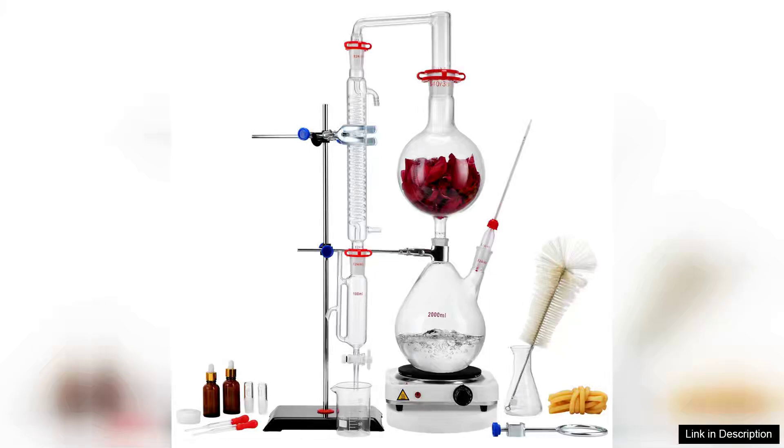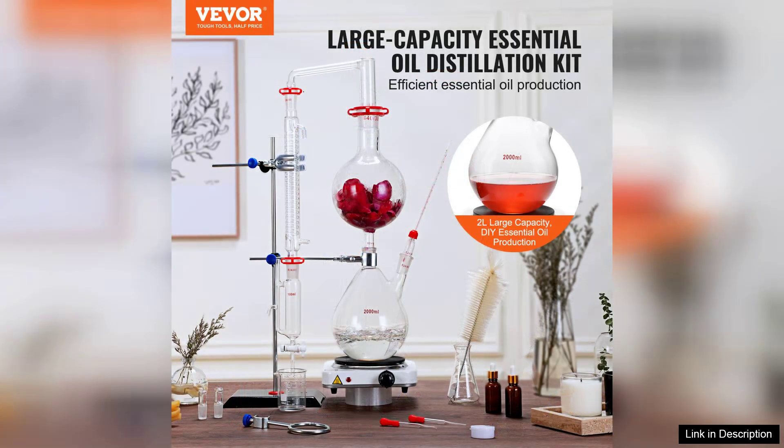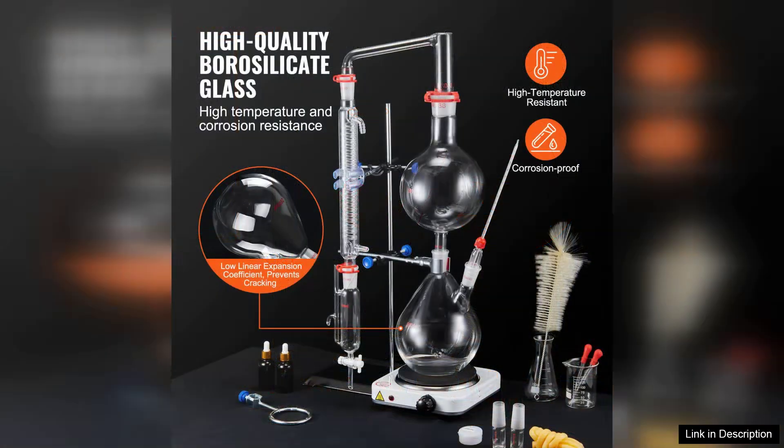I recently purchased the VEVA Essential Oil Distillation Kit and I must say it has exceeded my expectations. This 2,000 mL distillation apparatus is perfect for both beginners and seasoned enthusiasts looking to extract essential oils from plants and herbs.